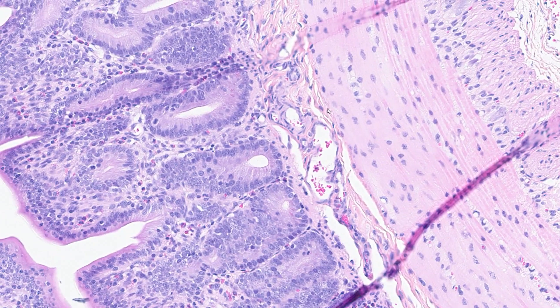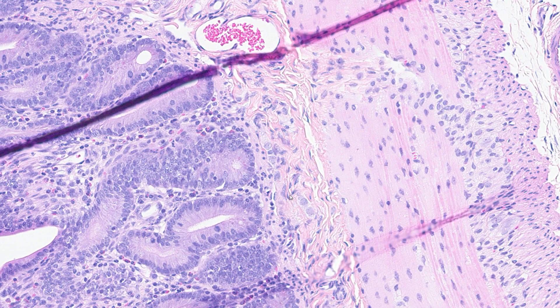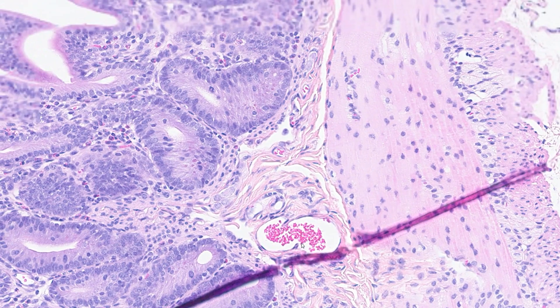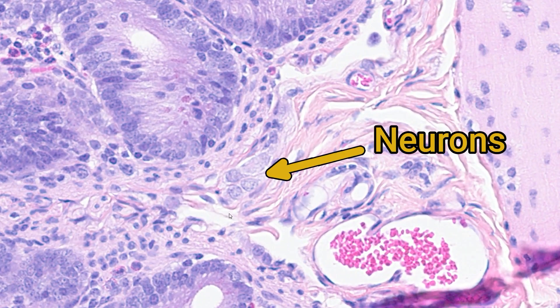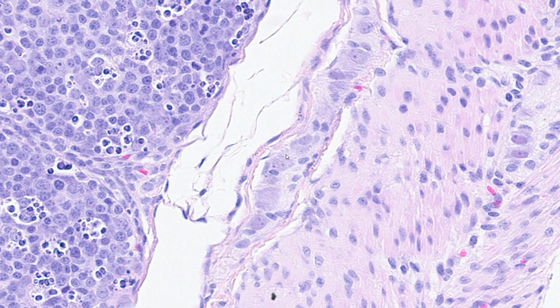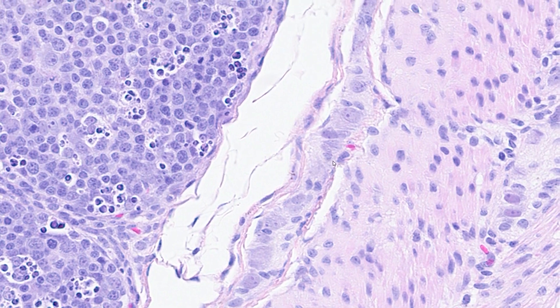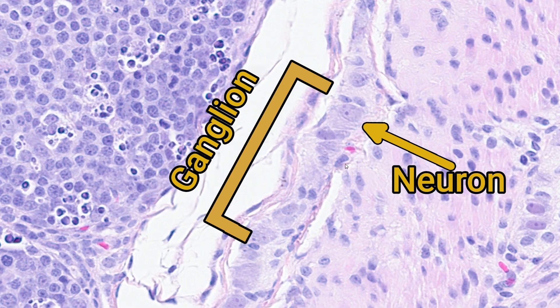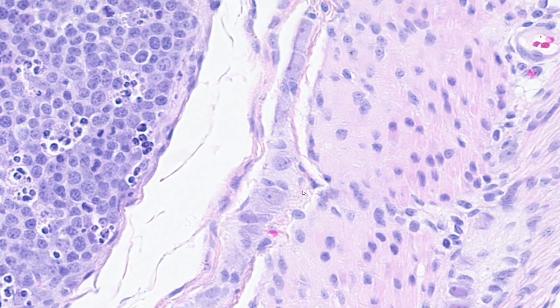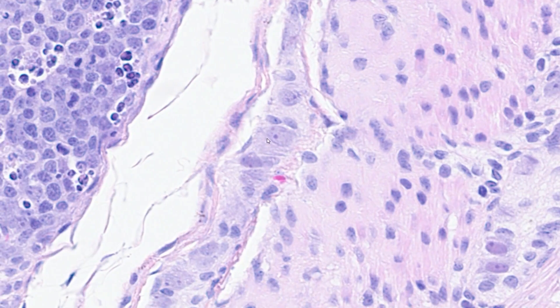The last structure to find in the submucosa is ganglia, which are composed of neurons. The neurons have slightly more basophilic, granular cytoplasm and are quite irregular in shape, with really large nuclei compared to the other cells in the submucosa, often with very prominent nucleoli.